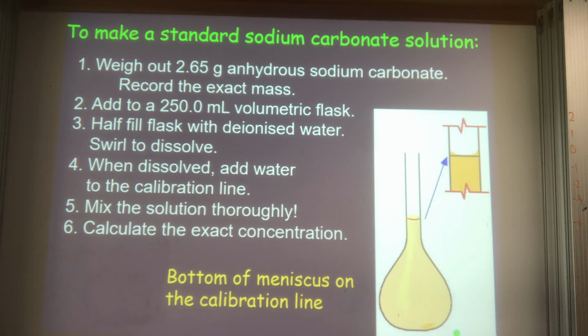And at that point, we've got a meniscus. So we fill up the volumetric flask till the level of the liquid reaches that graduation point. Because of course there's a curved surface, a meniscus, on any body of water in a tube, but it's the bottom of the meniscus, the bottom of that curved surface, which needs to be on the line. Just one of those practical considerations.